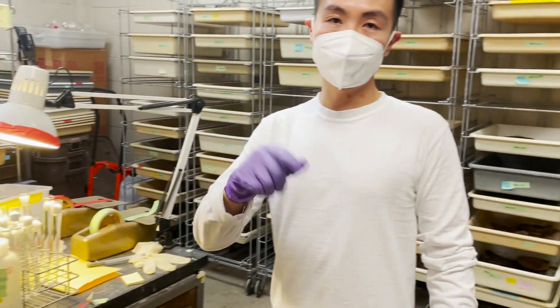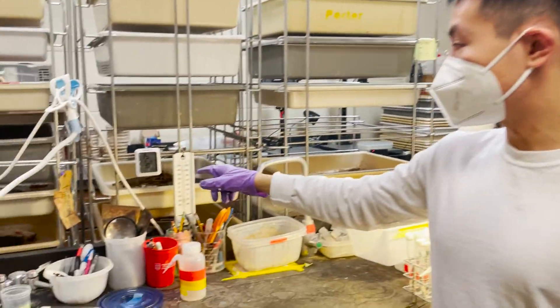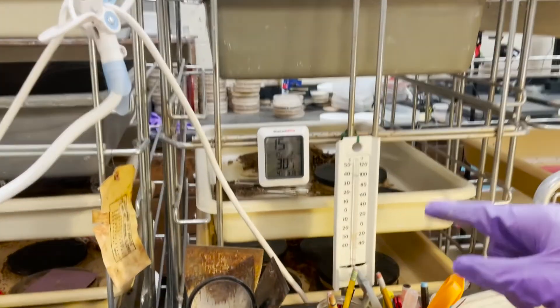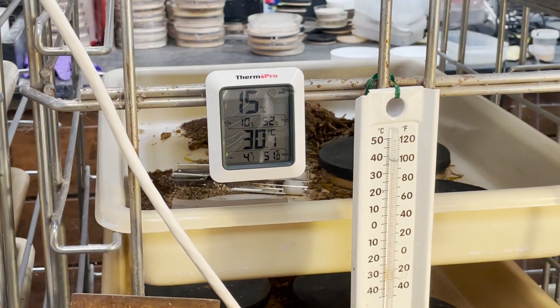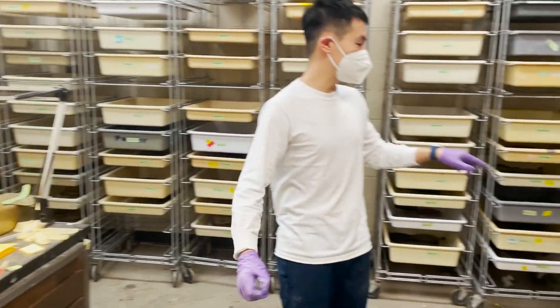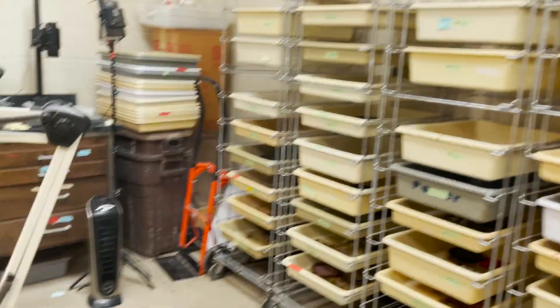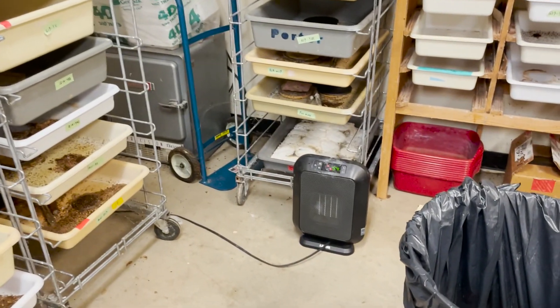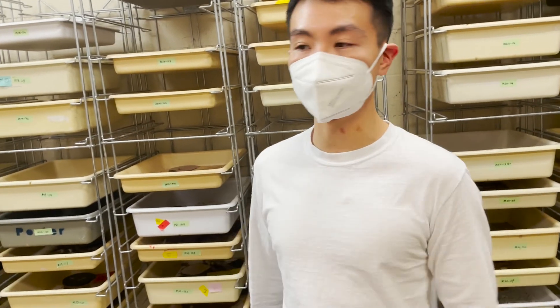About the temperature and humidity of this room, we keep them around 30 to 32 degrees Celsius, and that's when the fire ant colony grows the fastest. We have two heaters heating up the room to maintain the temperature. The room is not completely isolated from the outside so the temperature fluctuates a little bit, but that's okay — it doesn't affect things too much.